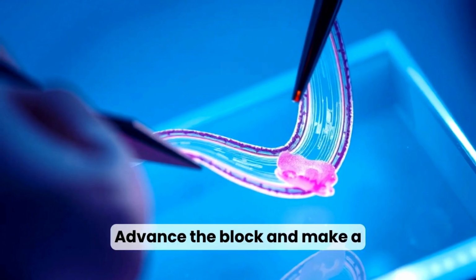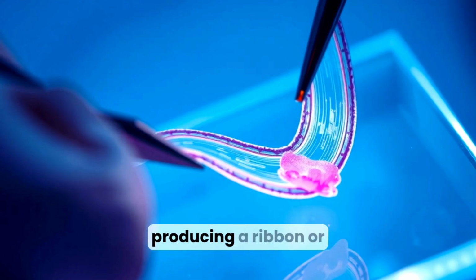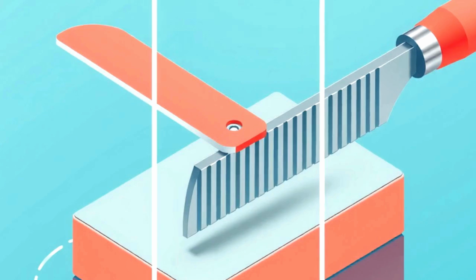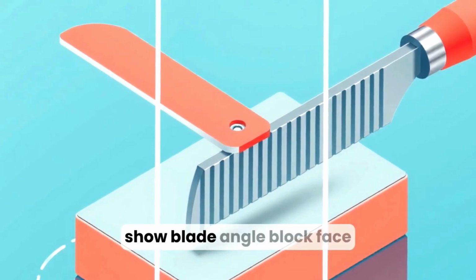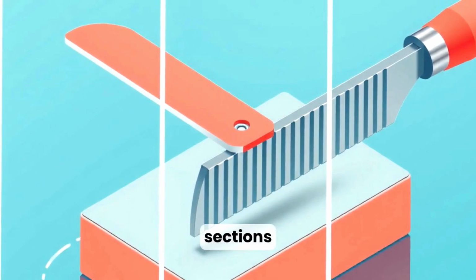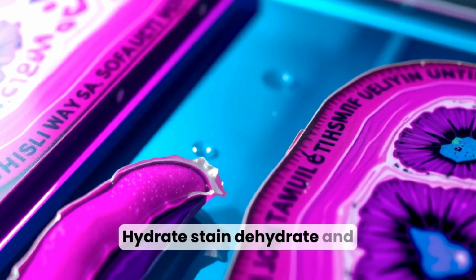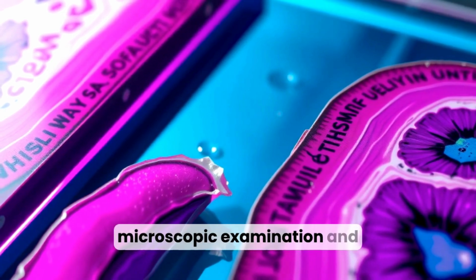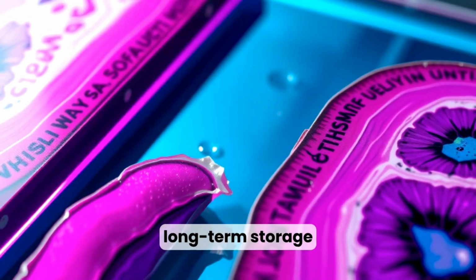Advance the block and make a series of knife strokes, producing a ribbon or individual sections that can be collected onto slides. Use simple labeled diagrams to show blade angle, block face trimming, and the sequence of cutting, floating, and mounting sections. Hydrate, stain, dehydrate, and cover slip the mounted sections to prepare them for microscopic examination and long-term storage.